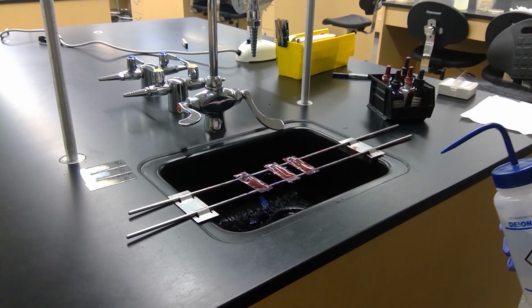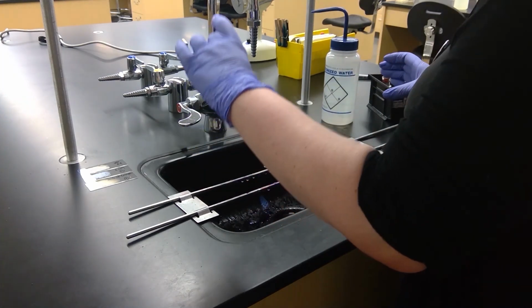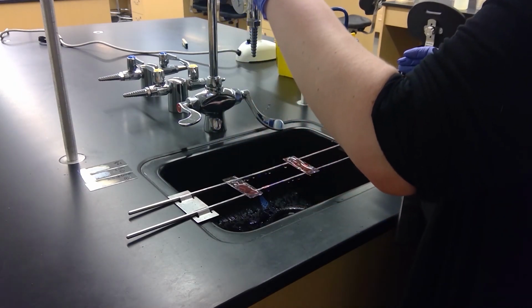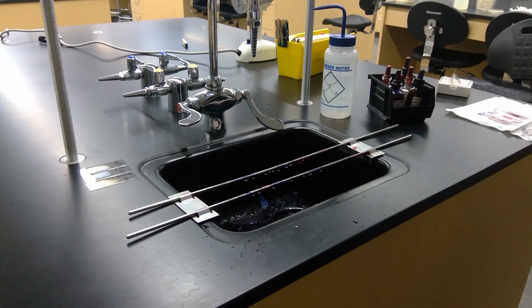And then step 13, rewrite labels with a wax pencil if you inadvertently rinse them off with the reagents. And then it says, place the stained slides between sheets of dry bibulous paper to remove excess water. Do not press the pad down with your hands. You may crack your slide.